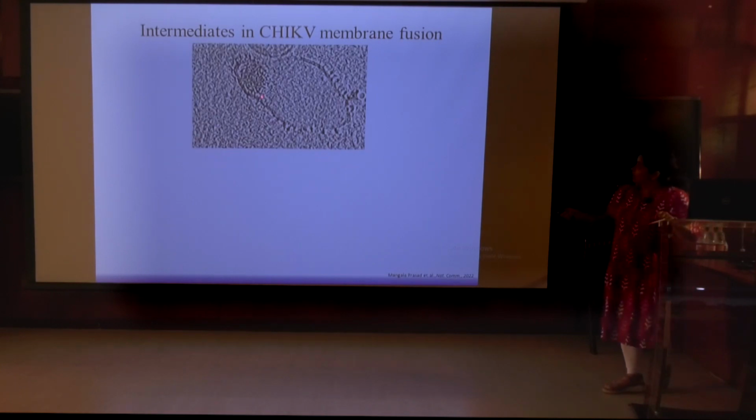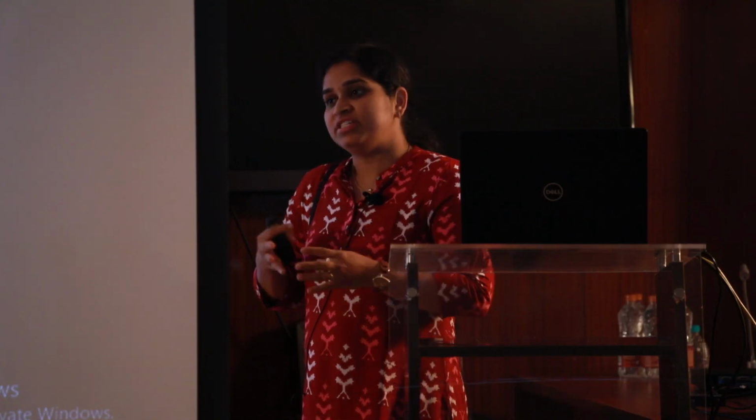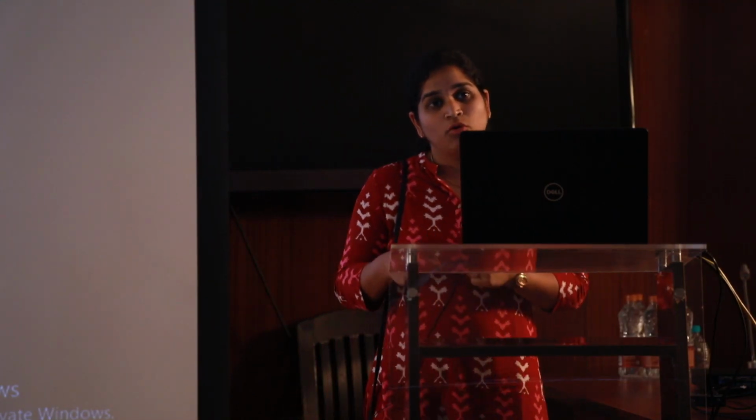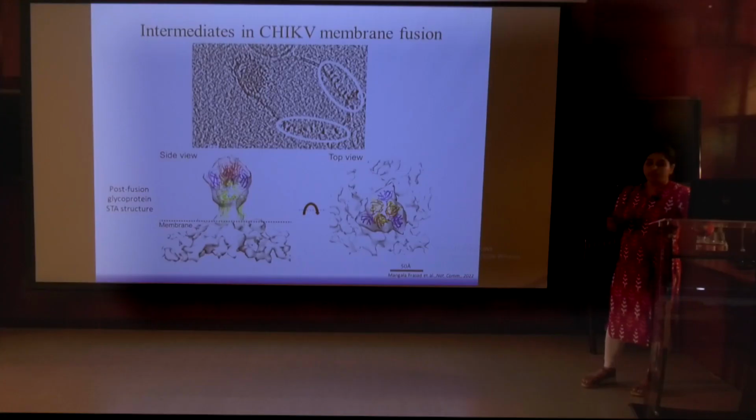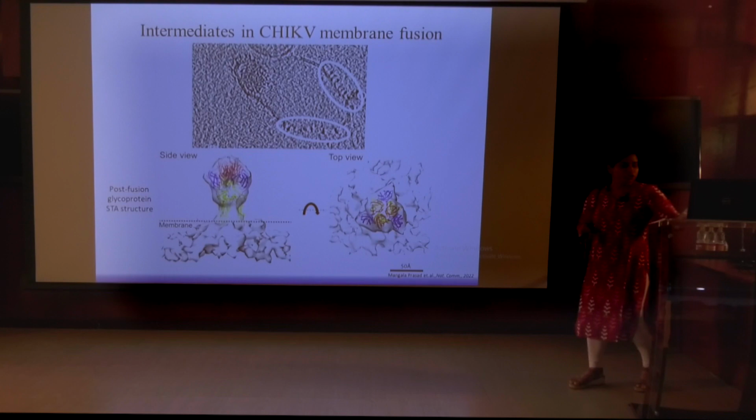We can also look at how the surface proteins have moved out and what kind of conformations these proteins can make. So pretty much every step of the process, you can now directly image and get a direct idea of how these structures look like and how it's actually accomplishing this fusion from a complete virus particle, fusing it and actually releasing its genome.